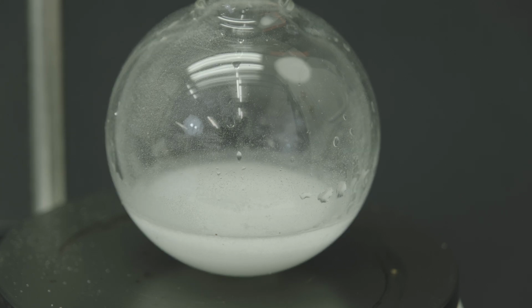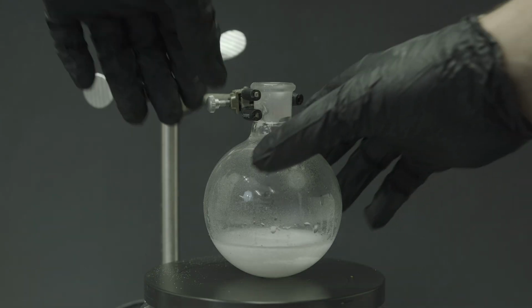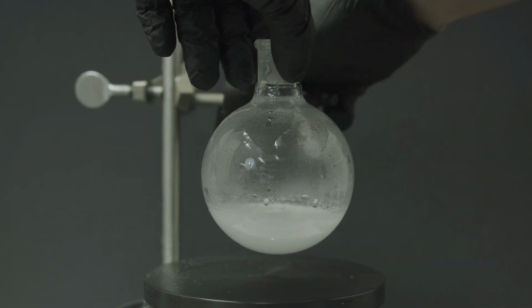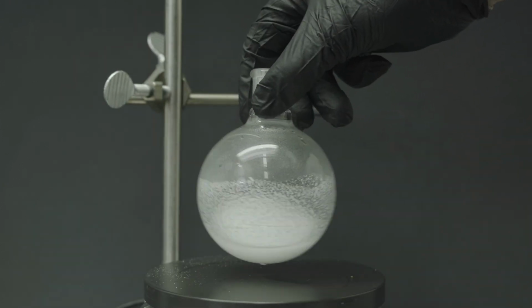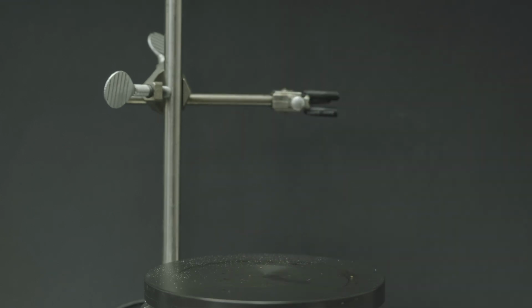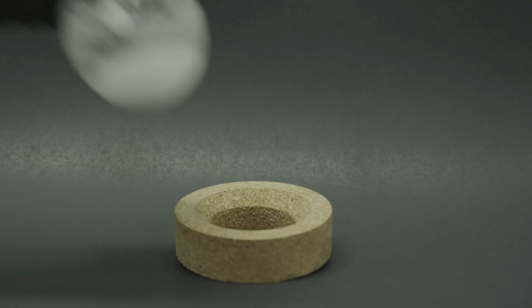But after I let it sit for a while, I knew that it was probably time to put it through a filter. Once I was ready, I took the flask off of the clamp and gave it a little swirl. I could see that there were a lot of particulates in there, and I was hoping that this was going to be my aspirin.